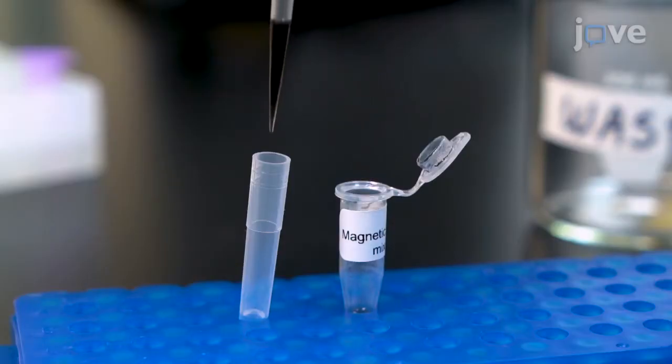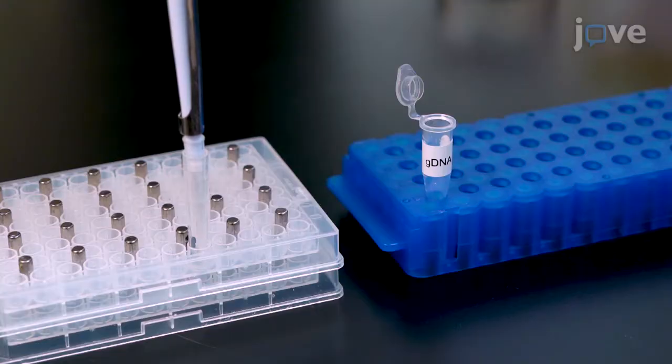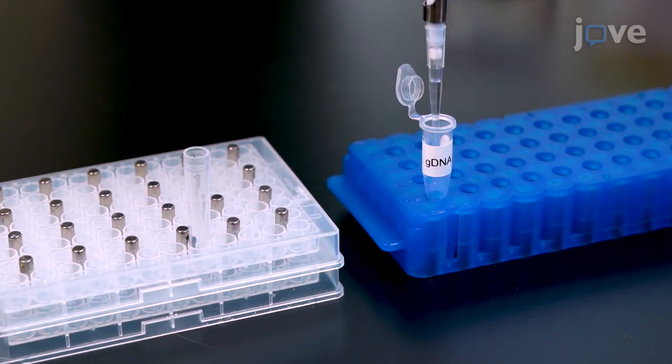This project-friendly magnetic bead-based DNA extraction protocol makes high-throughput sequencing accessible to resource-limited labs and studies. This protocol does not require expensive equipment for high-quality DNA extraction, and it can be helpful in certain diagnostic or research situations, but obtaining a sufficient quantity of DNA with a quality for high-throughput sequencing is challenging.